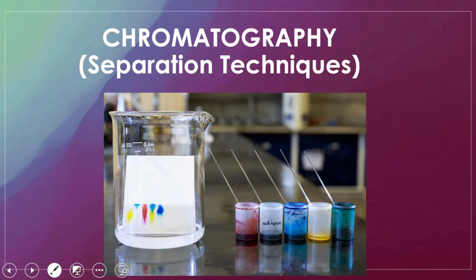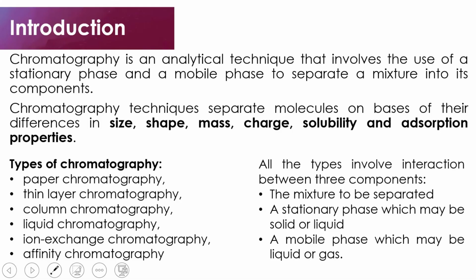In today's video and class, we are going to look at chromatography as a separation technique. We start our introduction by looking at what chromatography is. So chromatography is an analytical technique that involves the use of a stationary phase and a mobile phase to separate a mixture into its components.